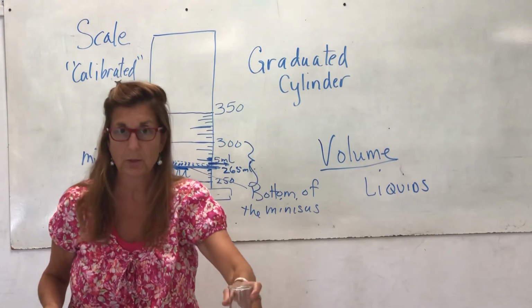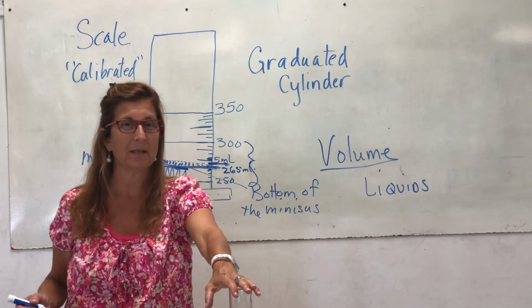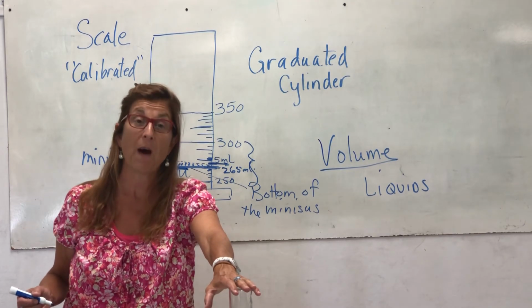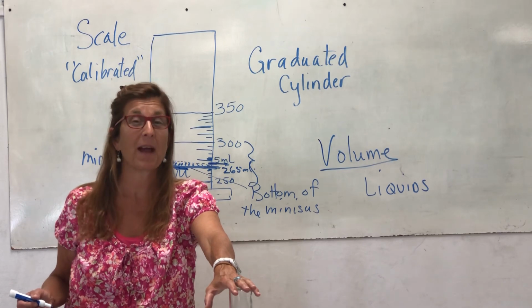So part of our measurement lab this week is going to be for you to look at different cylinders with different amounts of fluids, find the meniscus, and read it correctly. So I hope you have fun practicing.